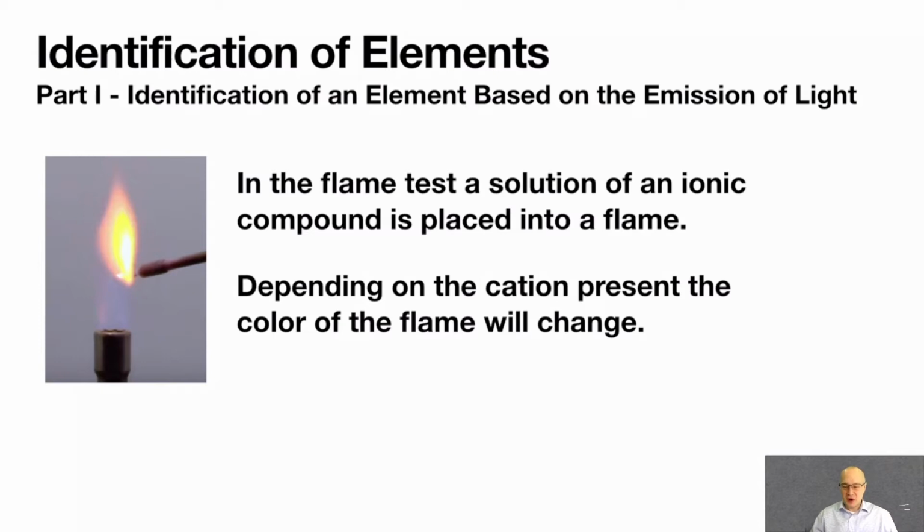We're going to light a Bunsen burner, and we're going to put certain salts, literally salts in solution, and we're going to burn them. You're going to note down what salt I'm burning and the color that it gives you. You'll be surprised at some of the beautiful colors we can get from salt. In doing this experiment, you're going to identify two unknowns just by color. Very simple, very fun.